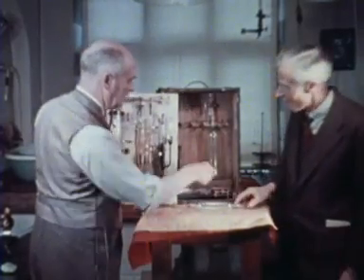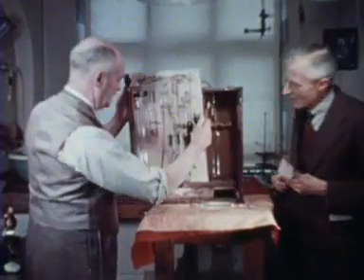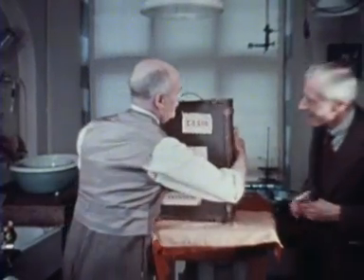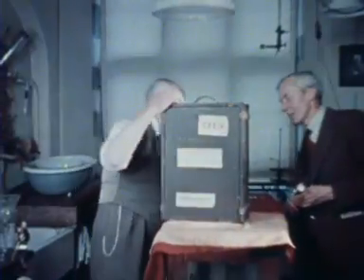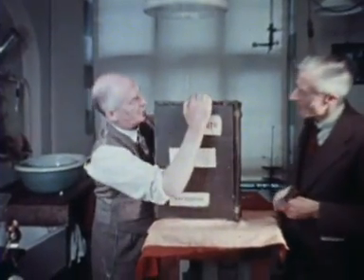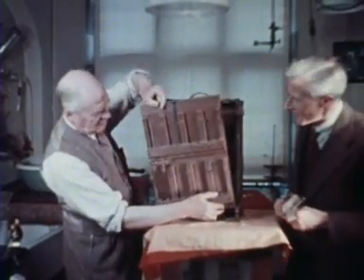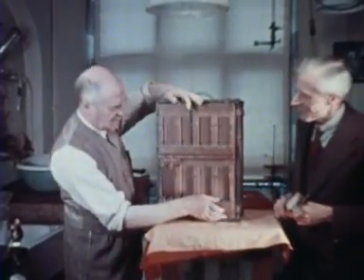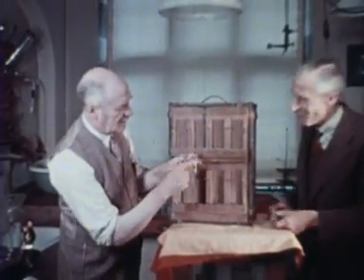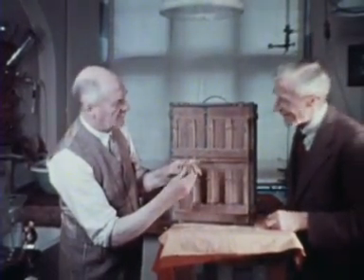The admiring onlooker on the right is Dr Adrian, later to become Lord Adrian. On the racks, this side, he would normally mount eight Barcroft differential manometers, although for this demonstration he is using only one. The Barcroft differential manometer was a forerunner of the Warburg manometer.